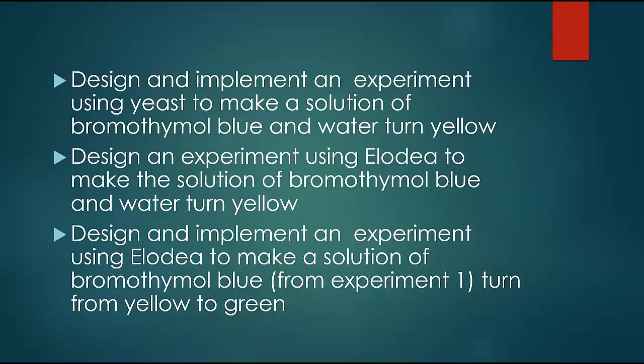So what you're going to do after that initial demonstration when you bubble in your own breath into a test tube, is you're then going to design and implement an experiment using yeast to make a solution of bromothymol blue and water turn yellow, just like it did with your breath.